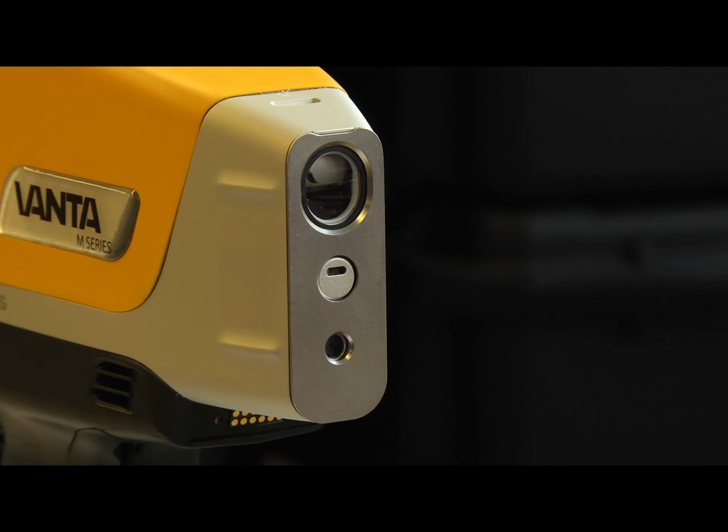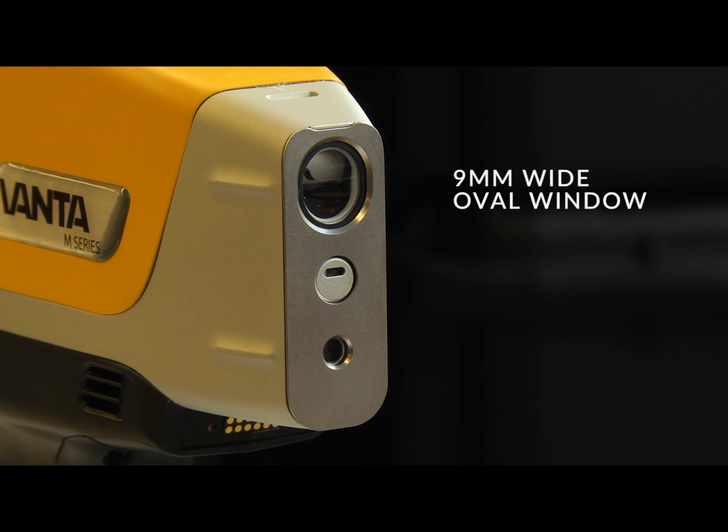I want to start our discussion with the nose of the analyzer. Two things I want to point out. The active area of measurement on our instruments is a circular oval shape about 9 millimeters wide. So whatever you place in front of that area will be measured.